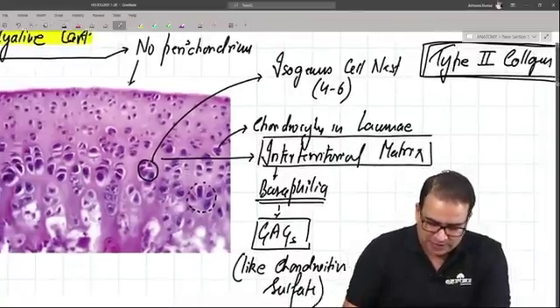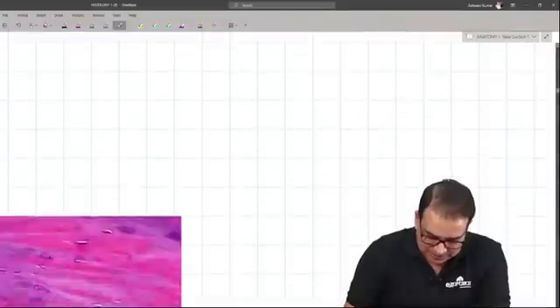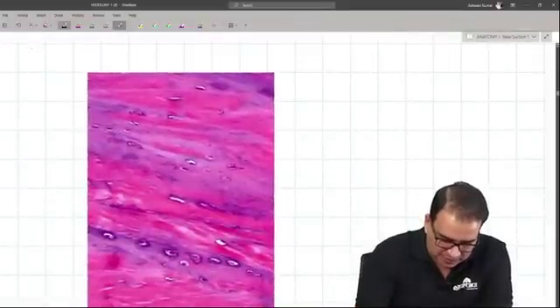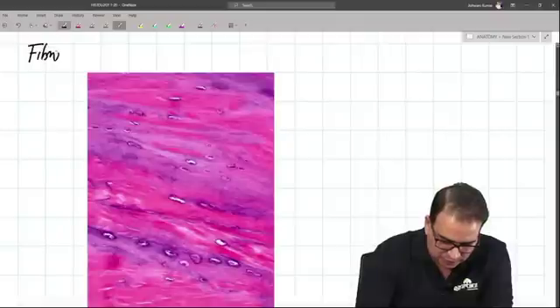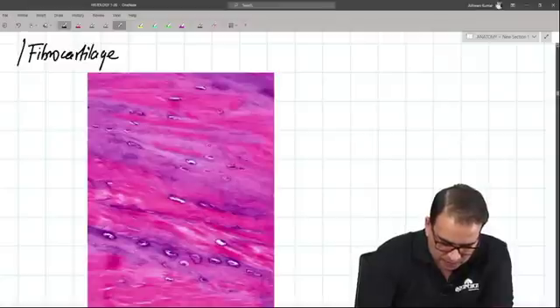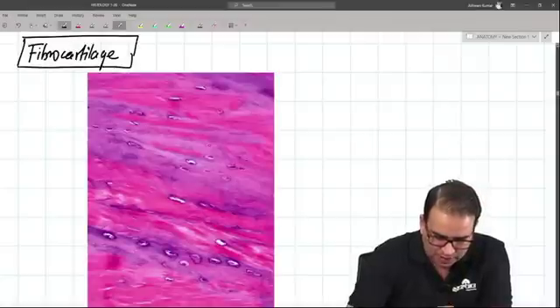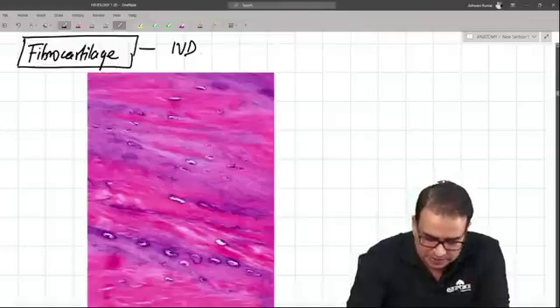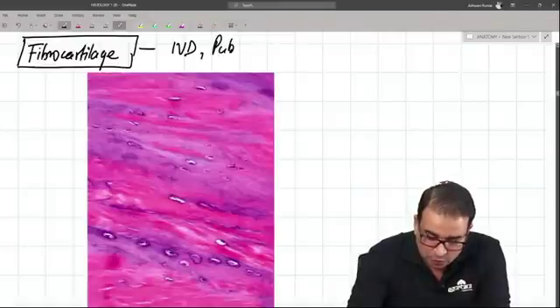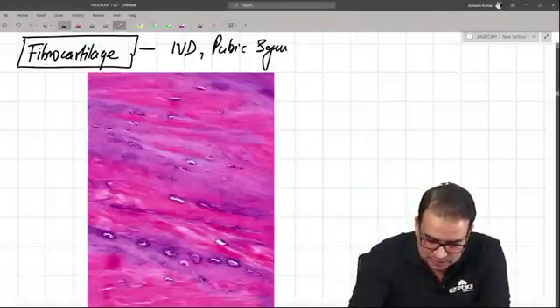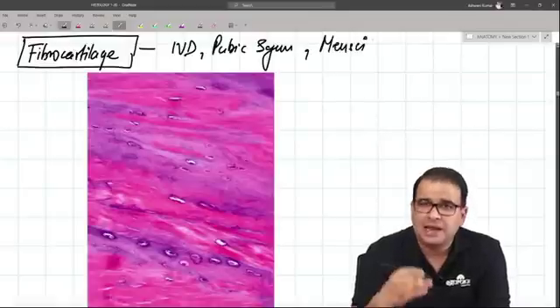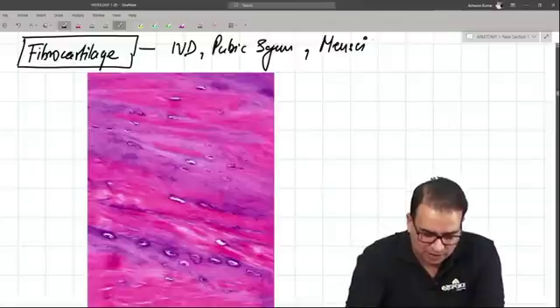Moving on to the next slide — slide number six. This is a slide of a cartilage, but this time it's fibrocartilage. Examples of fibrocartilage include the intervertebral disc, pubic symphysis, menisci, and labrum — all of these contain fibrocartilage.